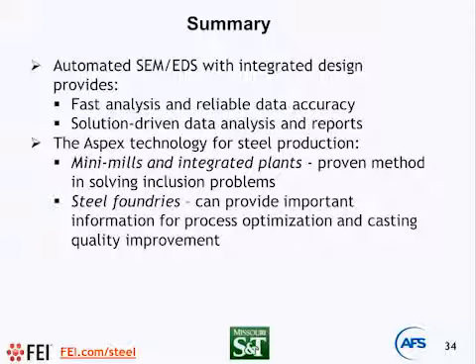And I would like to say that this method definitely presents a real situation, with some variations, of course. Other methods which could be used for three-dimensional mapping are of course very important. But today, that method I would consider macro. We don't have any technique that allows us to go to less than 50 micron. But today we talk about inclusions in the range from 1 to 10 microns.